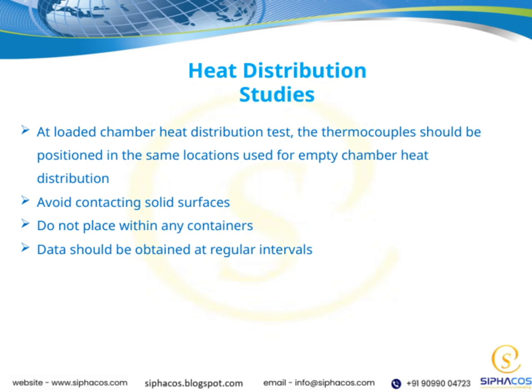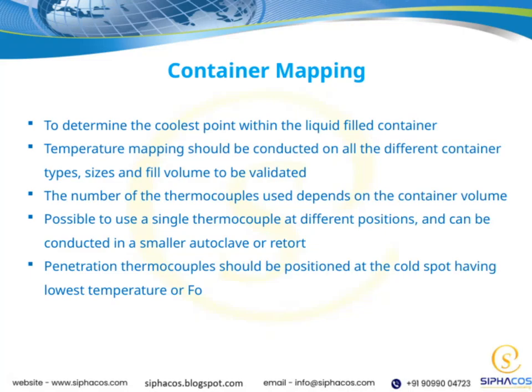By following these guidelines, we can ensure our measurements are reliable and comparable, which ultimately helps us understand how heat behaves in loaded chambers. This step is vital for validating our thermal models and improving the overall design of our system. To determine the coolest point within the liquid-filled container, I recommend conducting temperature mapping across all the different container types, sizes, and fill volumes that need validation.